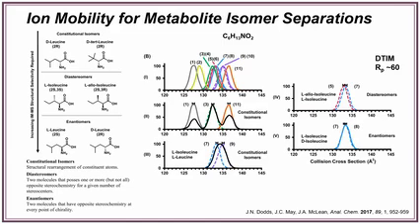If you had a mixture of these two, in the black trace, you see just one peak. And as you start moving to more subtle differences, like diastereomers, alloisoleucine and isoleucine, and the enantiomers, so L versus D, those you're unable to separate at this particular resolving power.